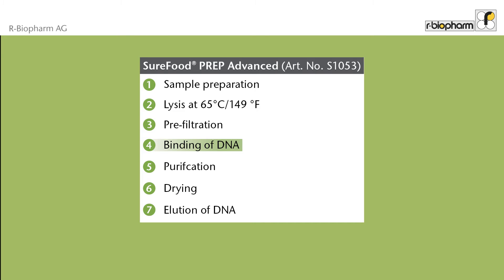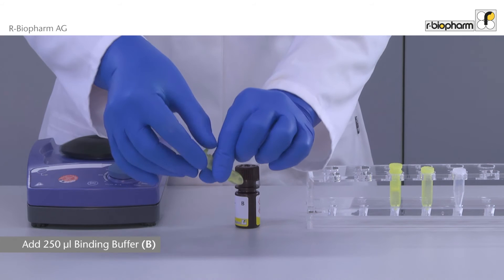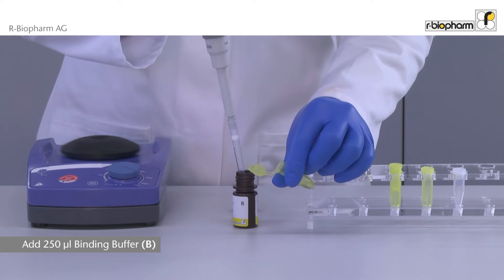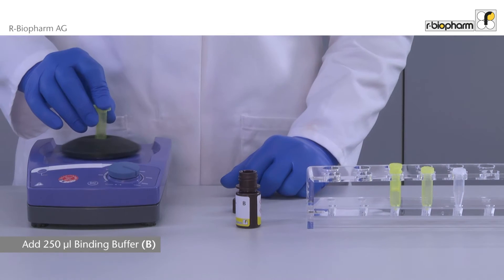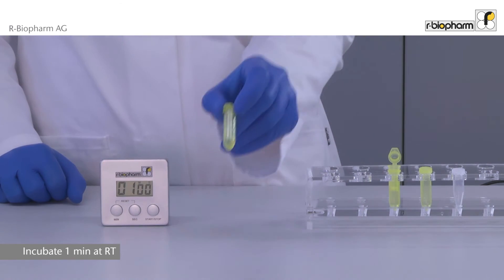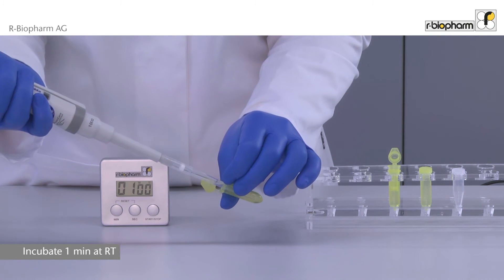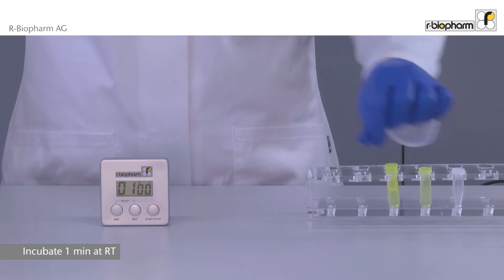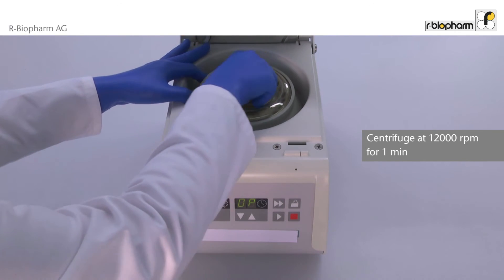In the fourth step, the DNA binds to the silica matrix of the yellow spin filter. After the centrifugation step, discard the clear spin filter. Add 250 microliters binding buffer to the filtrate in the yellow receiver tube. Mix thoroughly. Transfer the whole solution directly onto the yellow spin filter placed in the yellow receiver tube. Incubate for one minute at room temperature. Centrifuge the yellow receiver tube with the yellow spin filter at 12,000 rpm for one minute.